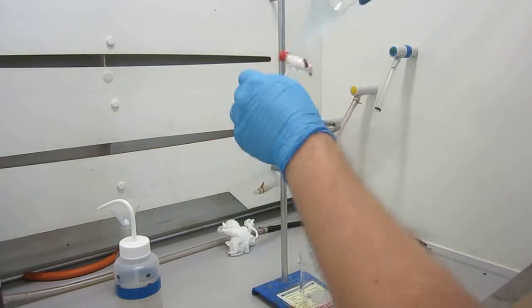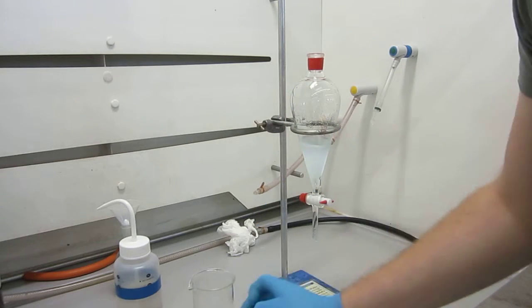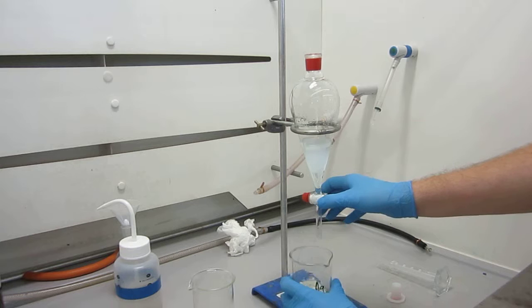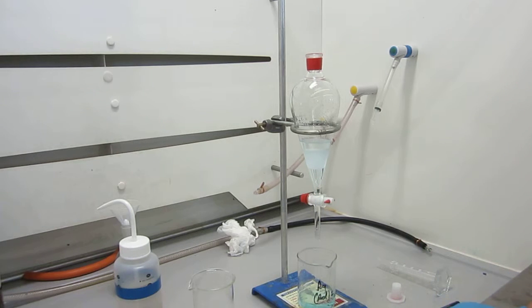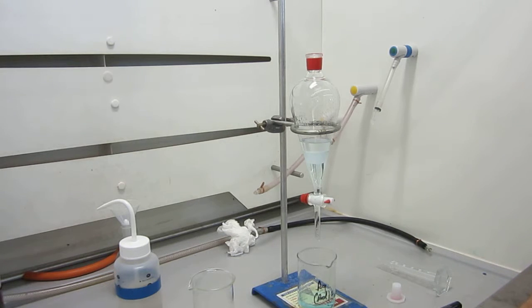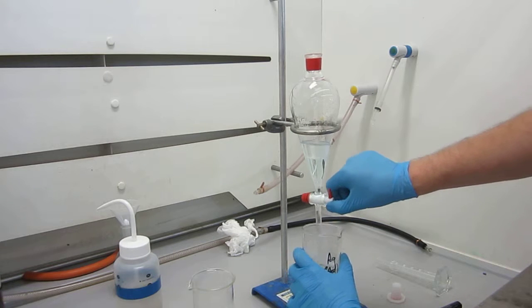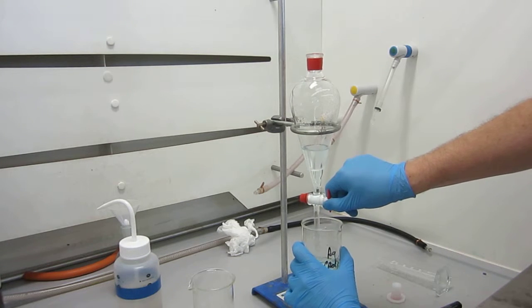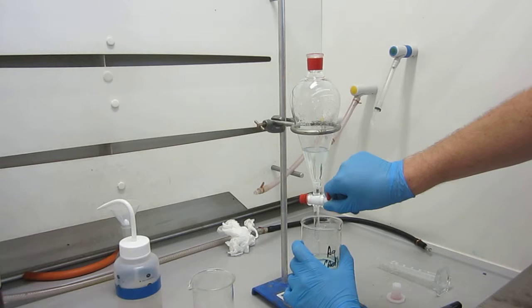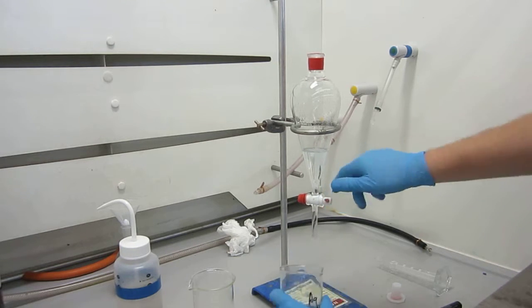There we go, so closed, back into the ring, bung out. I'm going to collect this one into the second fraction because I'm confident it's effectively the same components. So I'm just going to let it settle out, see how the cloudiness is disappearing as the layers separate. And run it through. Now you don't want to get any of the ethyl acetate layer through, especially on this final one, because it's going to have impurities. So I'm going to stop a little bit short, like that.